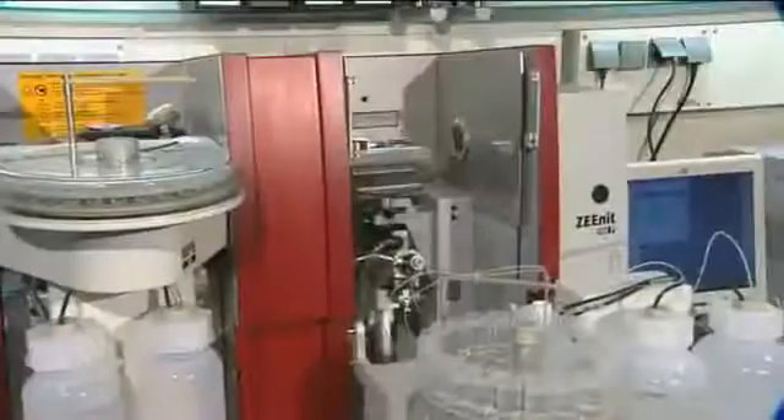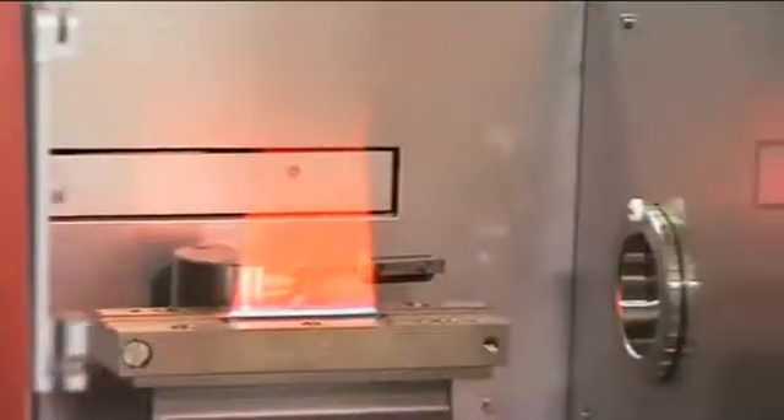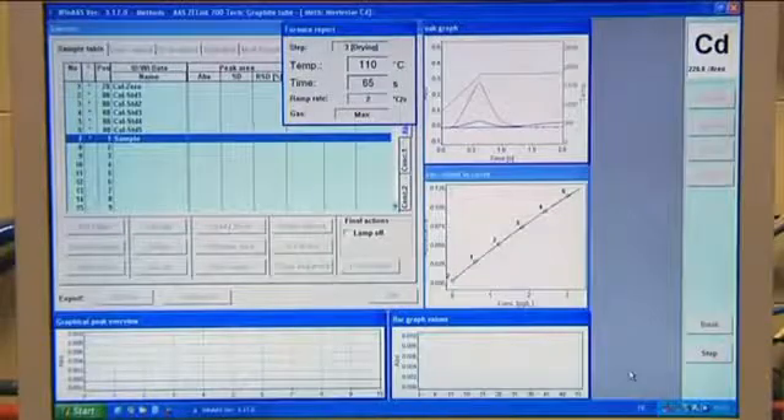The Zenith 700 atomic absorption spectrometer is a combined flame and graphite furnace system of the most recent generation. It is easy to handle and operate, its analytical performance is at the highest level, and it represents one of the most mature tandem AAS instruments of its kind.